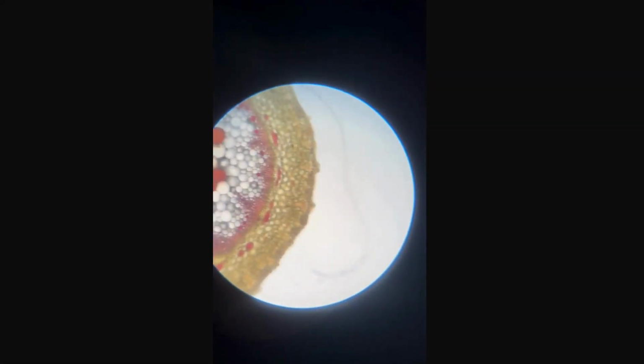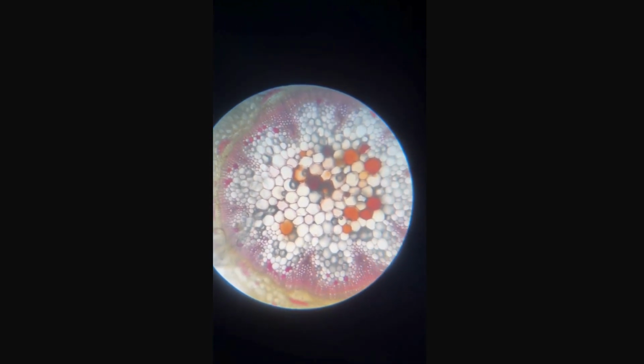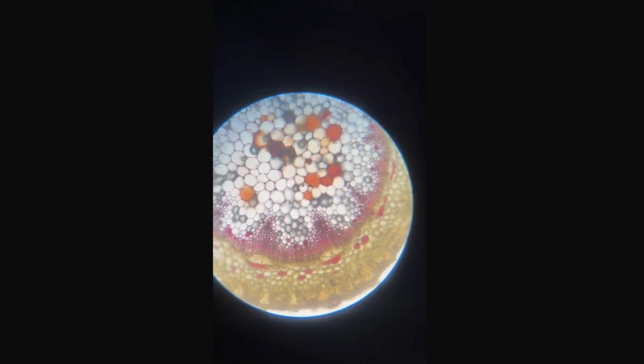As seen in the video, ephedra has a unique microscopical structure which includes components like epidermis, cortex, lignified and unlignified fibers, pericyclic fibers, xylem and phloem and pith.